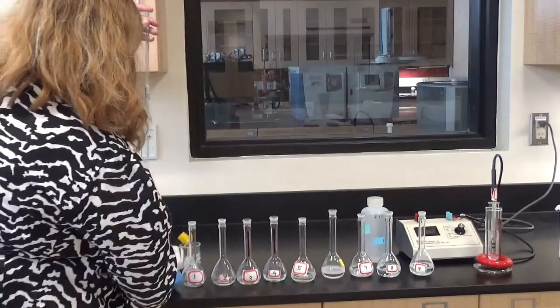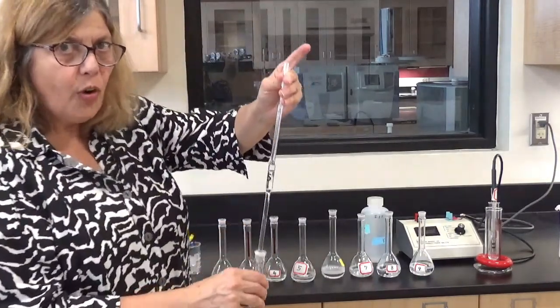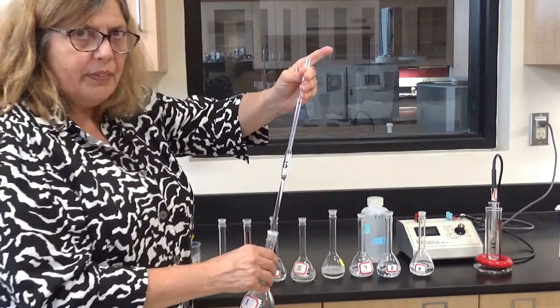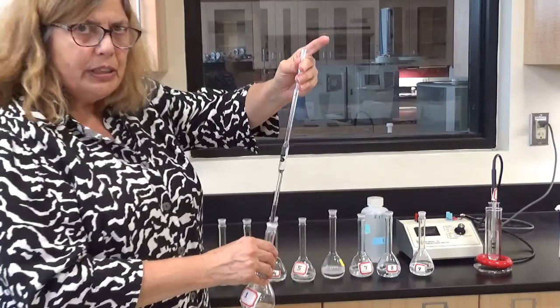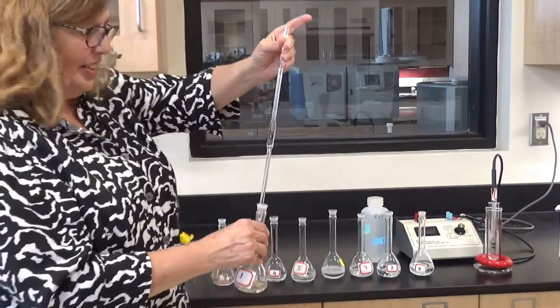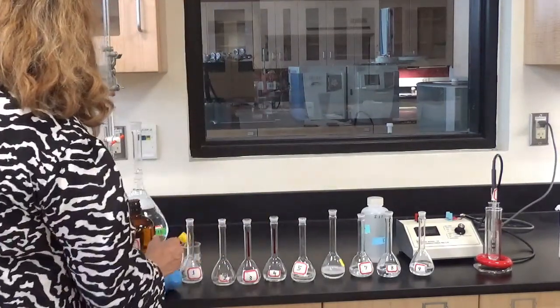Okay, solution 1. And I'm going to do the same thing for all of the solutions. I'm going to pipette 5 milliliters into each one of them, and then I'm going to bring them to the mark with deionized water and invert and mix 10 times. So that's my next steps. One is done.